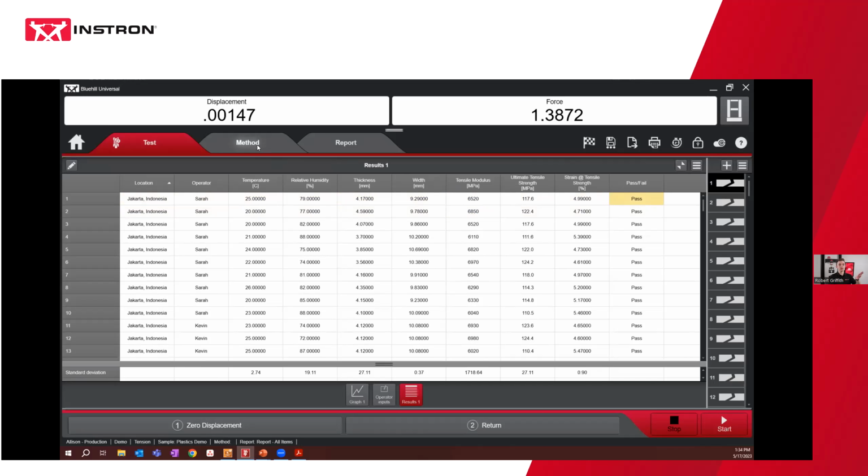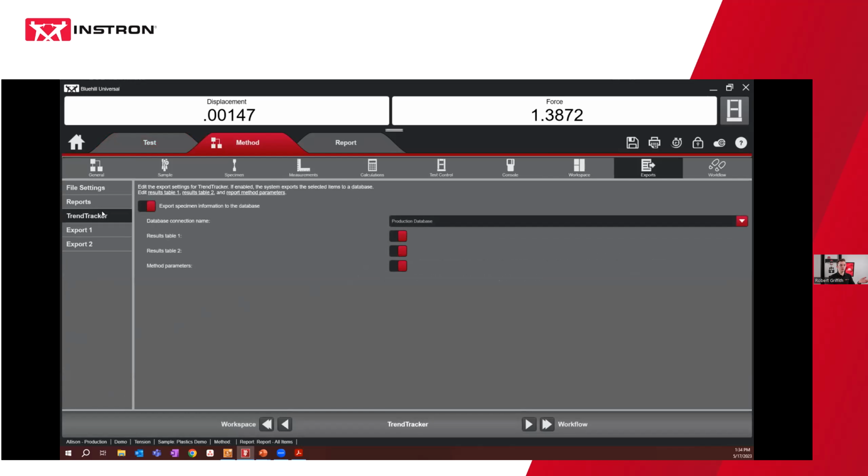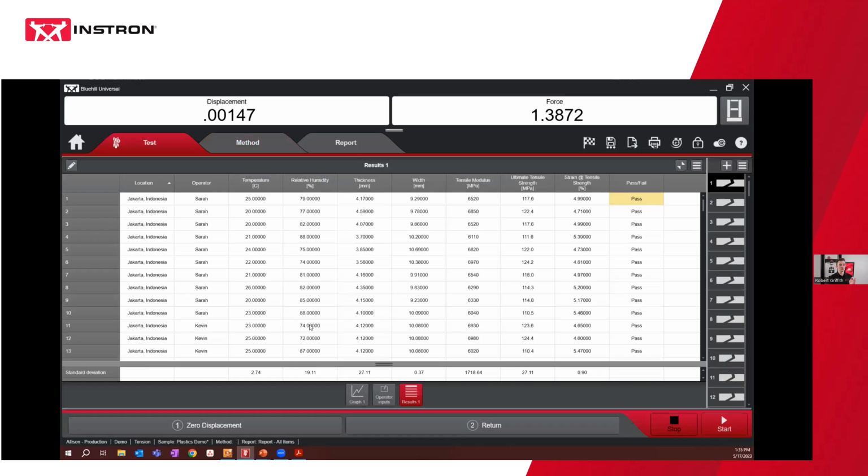The way that the Bluehill Universal software knows how to put this into Trend Tracker is underneath the method tab and then exports. And if you're utilizing Trend Tracker and you have the module for it, this button will pop up here. And then it's just a very simple toggle switch. So if I want to put data into a Trend Tracker database, I toggle this on, and then I click from the drop-down menu whichever database I have connected. In this case, I have one called production. And then I tell it what information to put into the database. The only pieces of information that we can put into it are whatever you have stored in the results table 1. So in this case, that's what I have here.